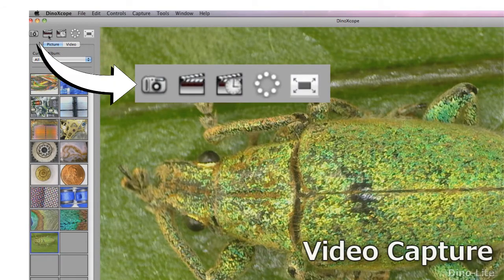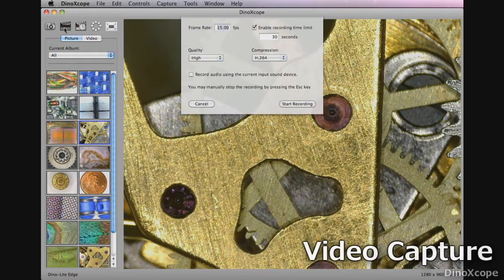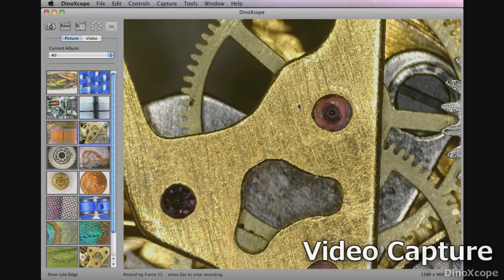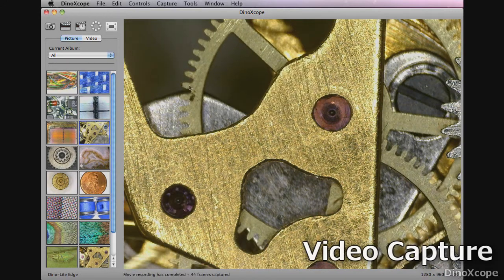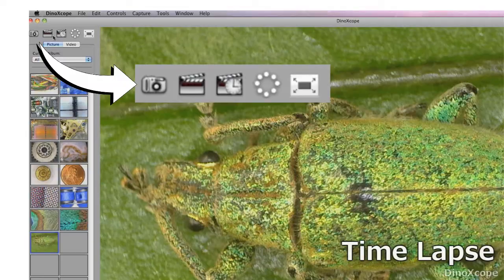Click on the video button and video settings will open. When ready click on start recording. To stop hit the escape key and the video will appear in the videos section.